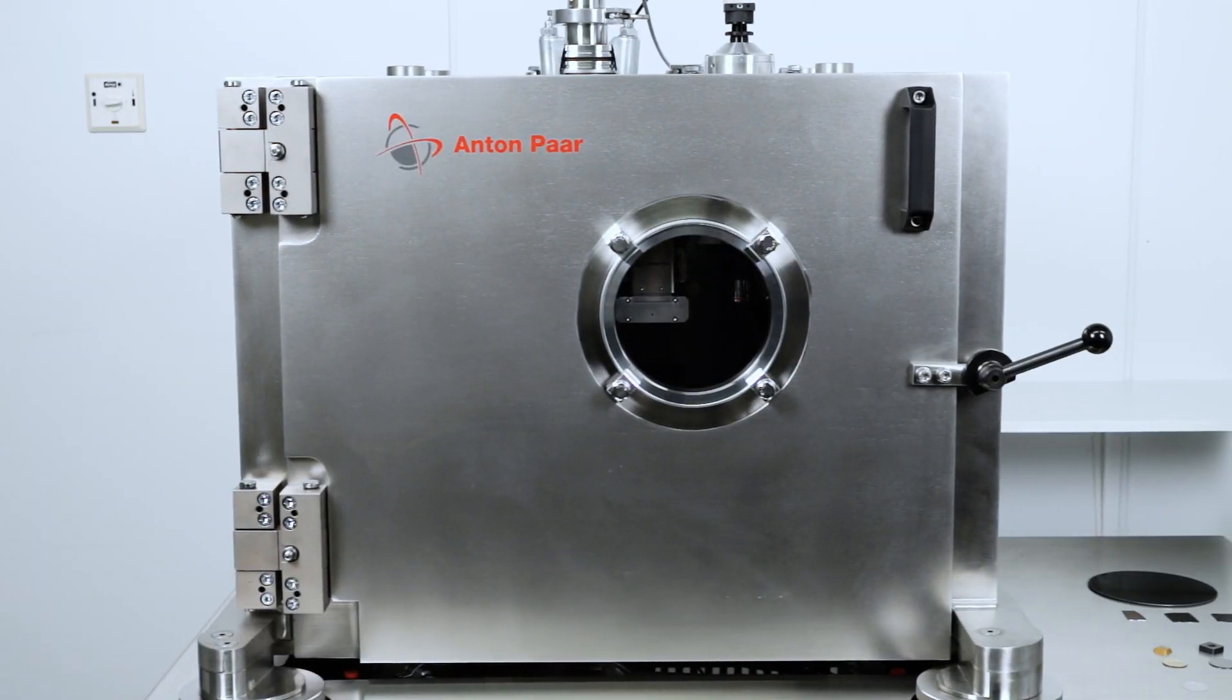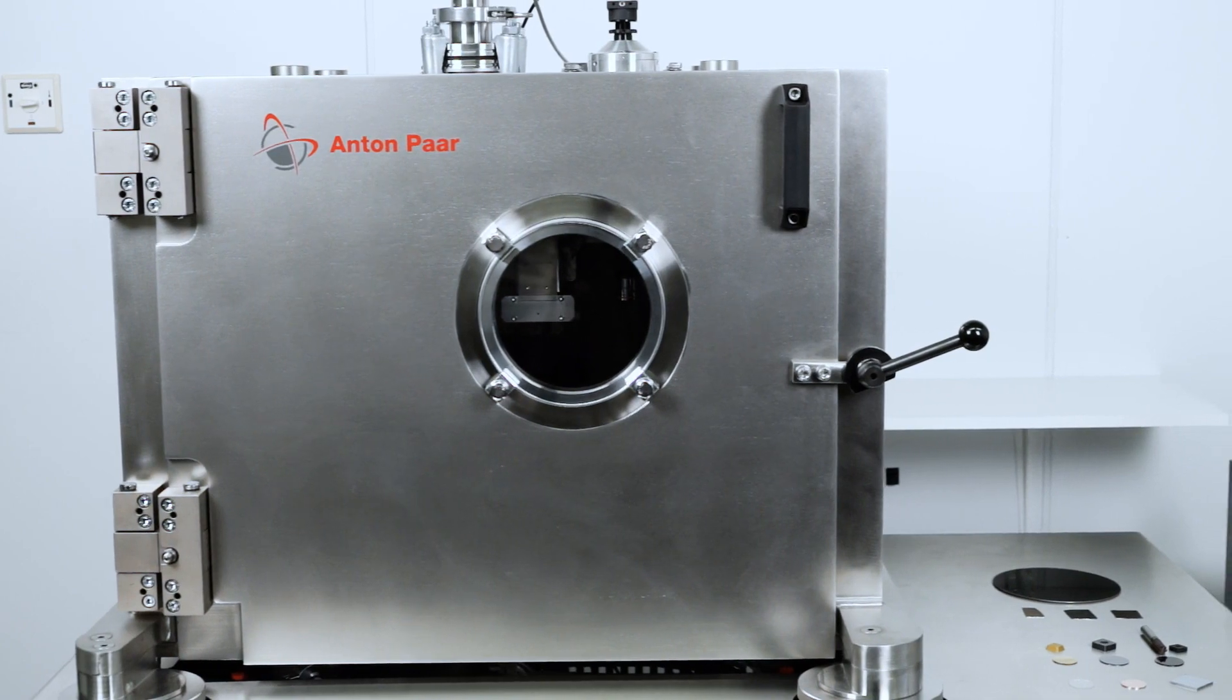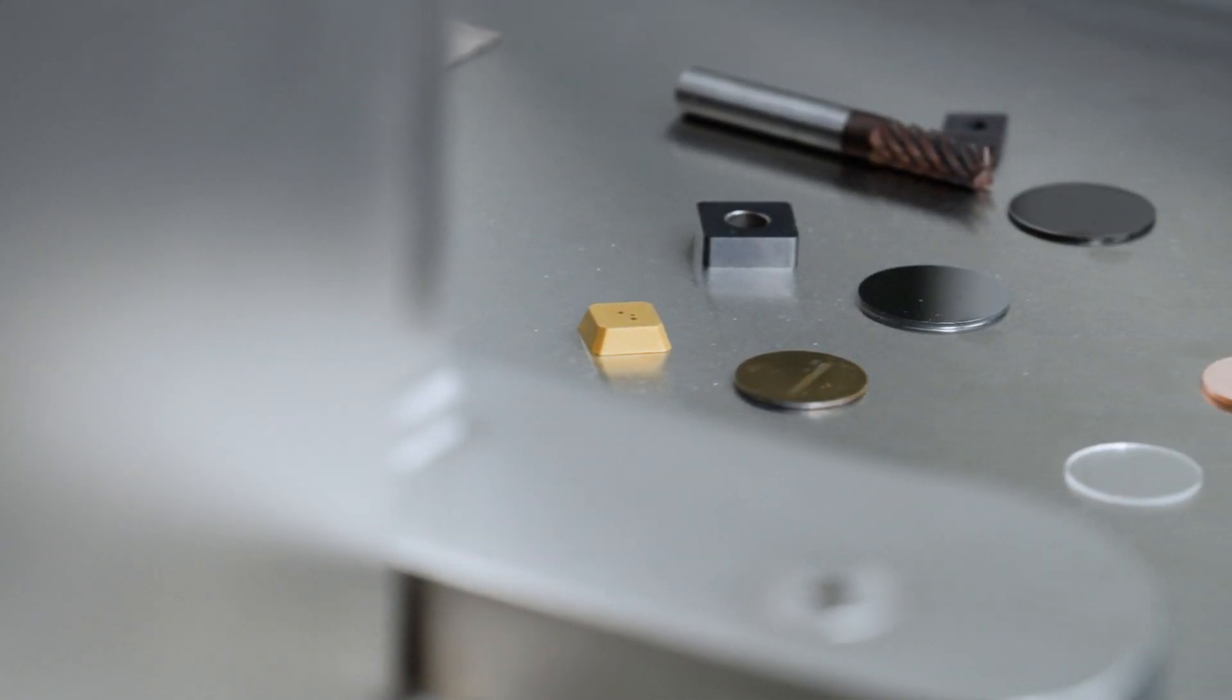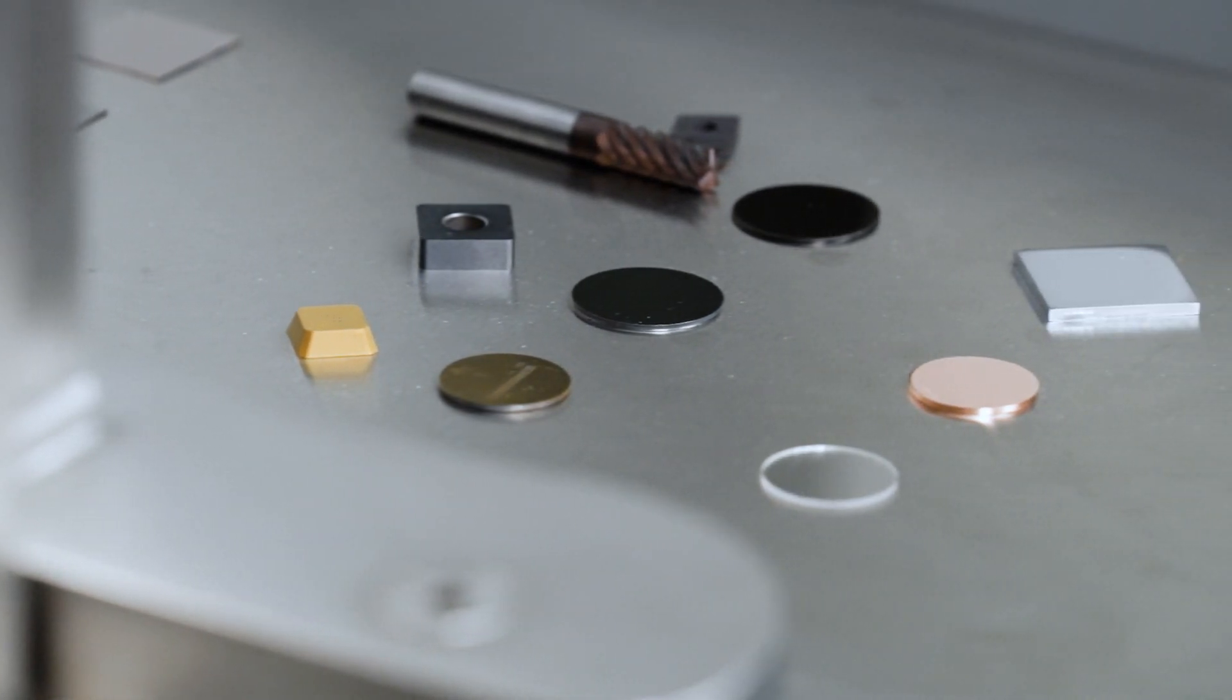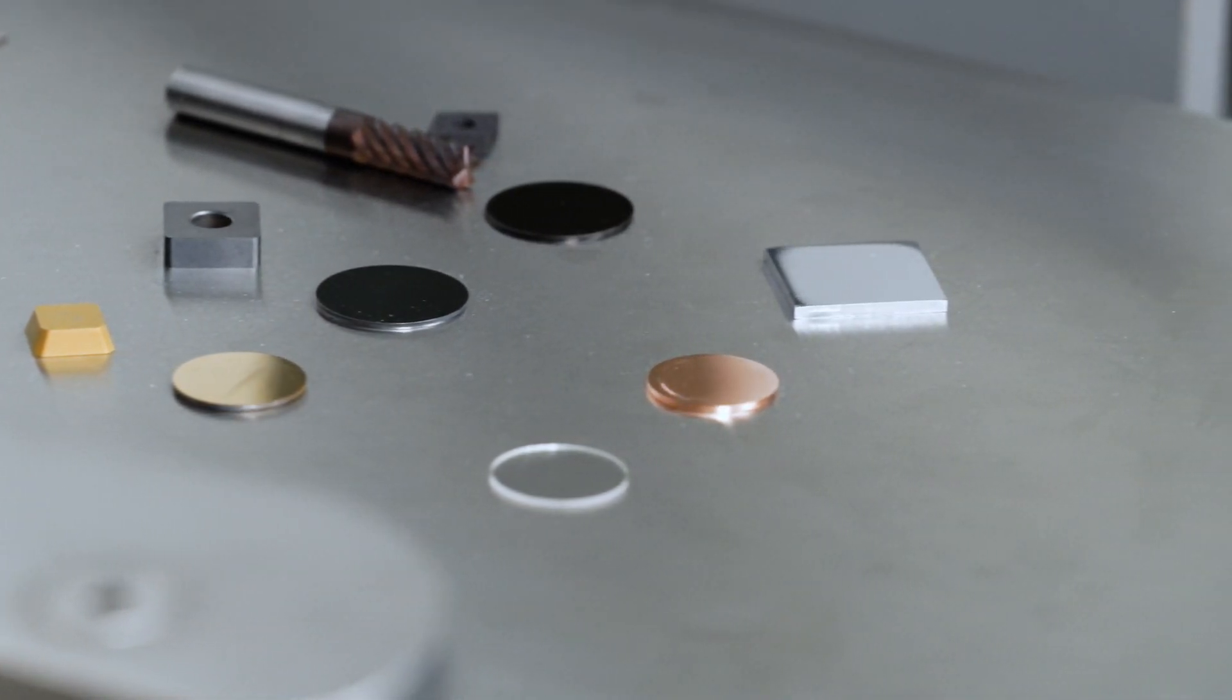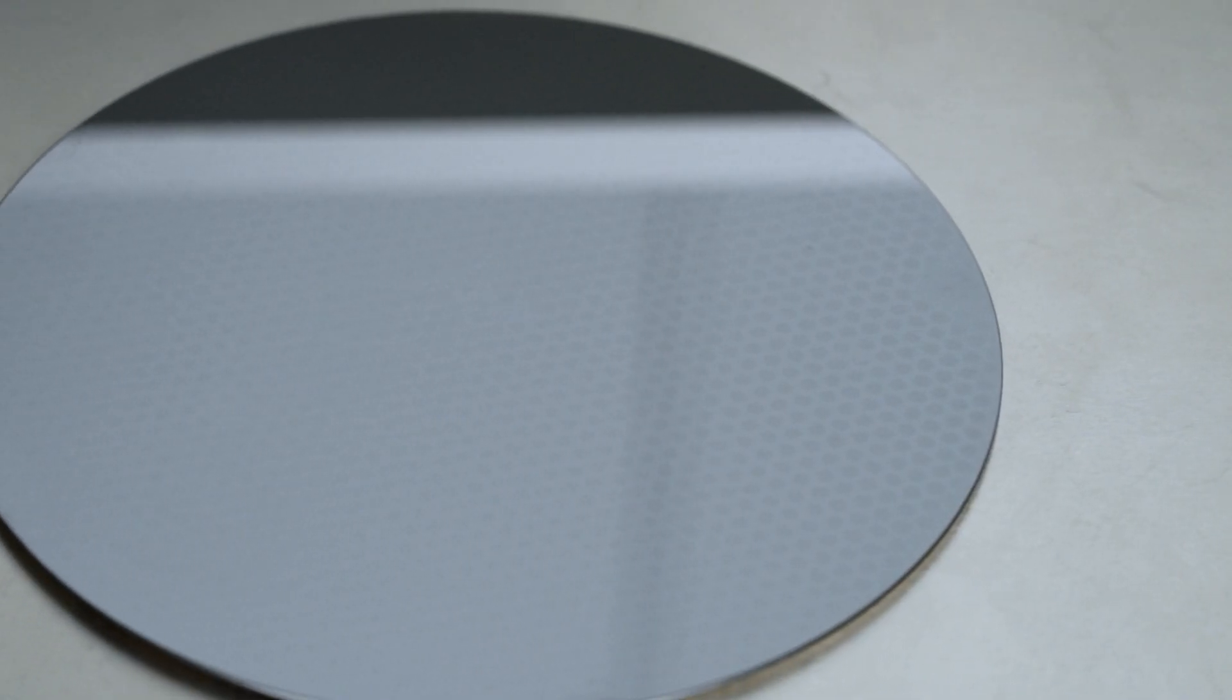Typical applications for high temperature nano indentation are, for example, the characterization of hard coatings, thermal barrier coatings, and shape memory alloys which can be found in cutting tools, turbines, air and spacecraft, and nuclear power plants.